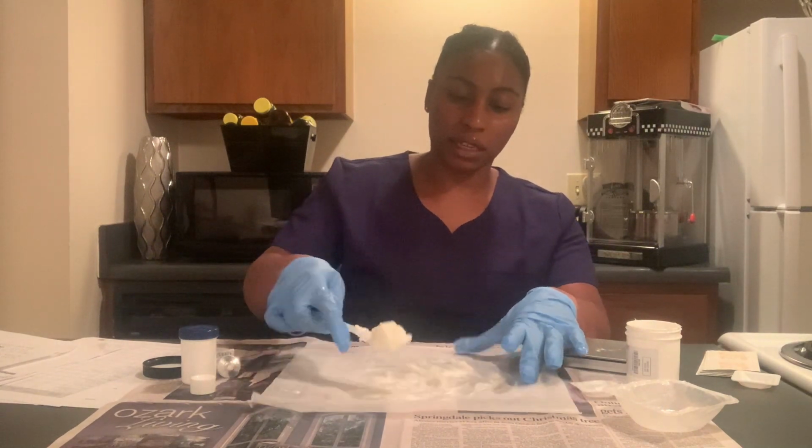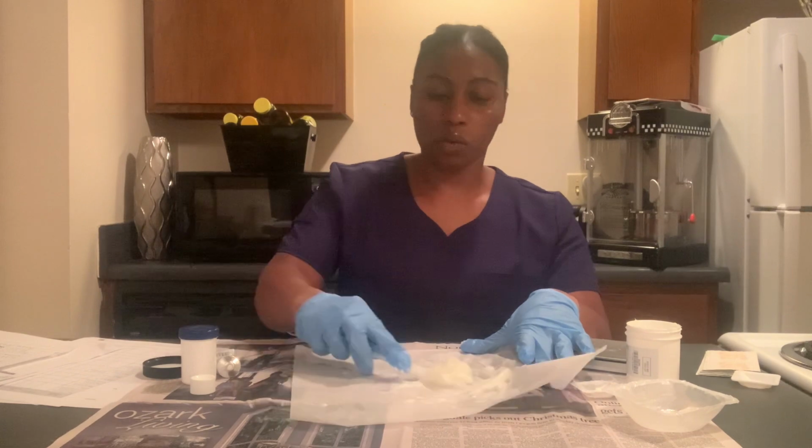And so make sure that you're mixing it very well, that it's all in one.